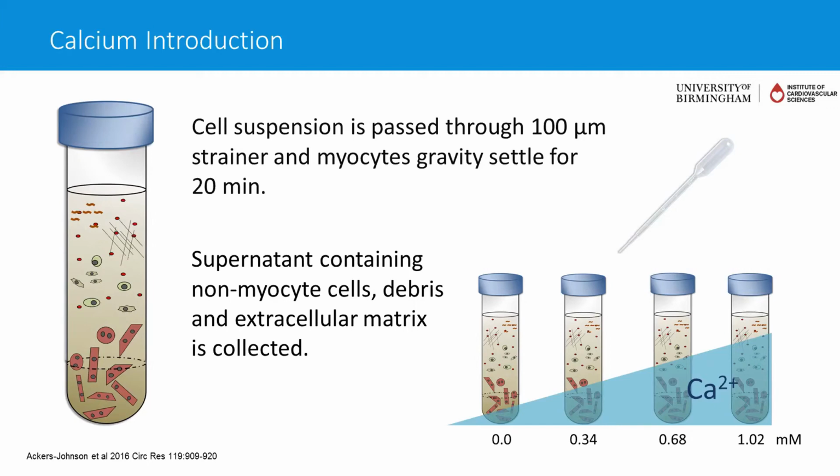Generally, if they're going to be good myocytes, in a couple of minutes they should all fall down, and we tend to grab that and go on to the next step. The yield will be lower, but the cells will be better.